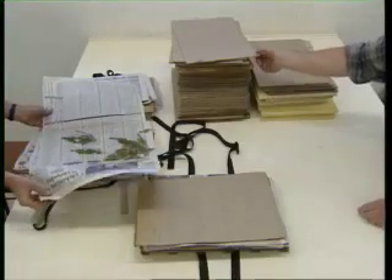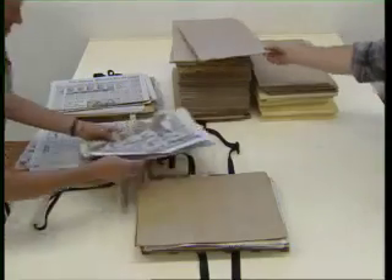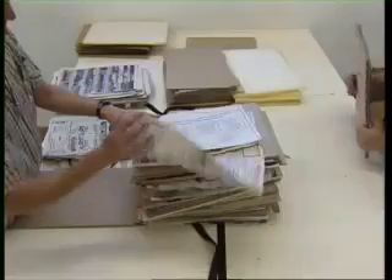At the end of each day, transfer the contents of the day press and bind with string between stiff paper. If you've been collecting into plastic bags, prepare the specimens between sheets of newspaper as if you were using a day press, and tie the contents between cardboards.